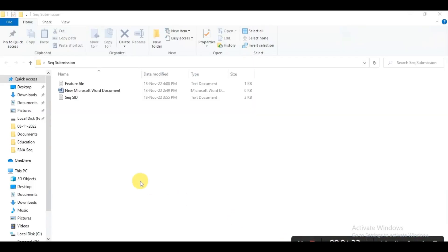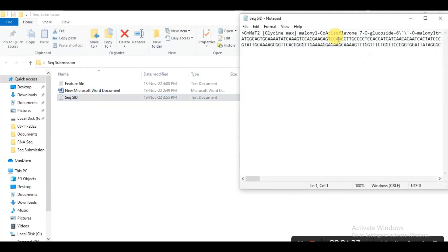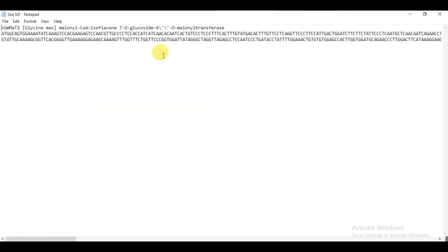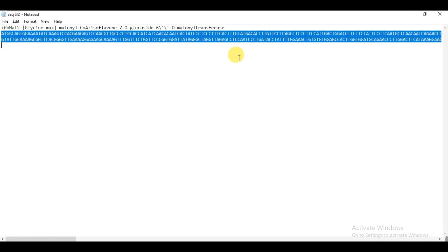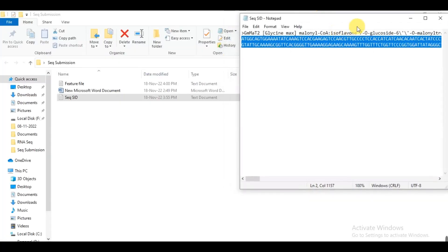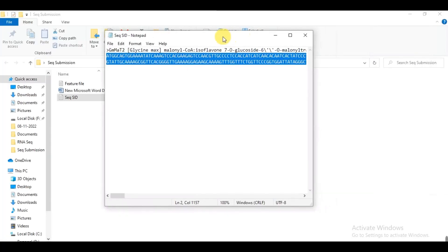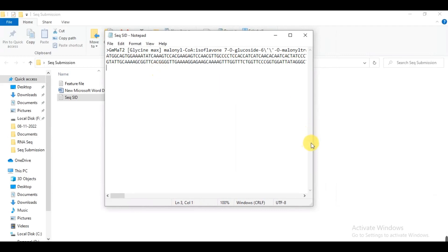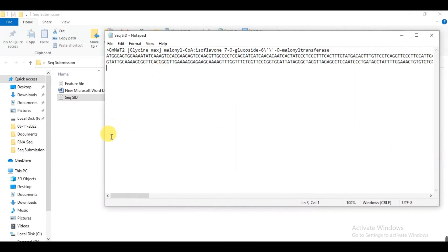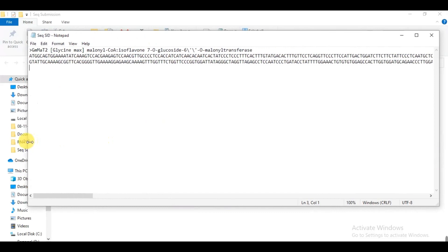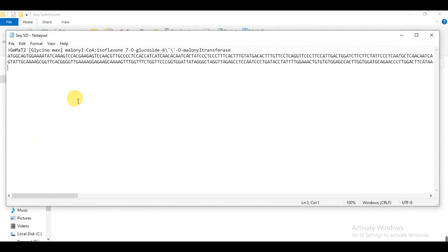First we need to prepare two files. One is our sequence file. This is my sequence file — this is the sequence of my gene that I have cloned and characterized its function through different experiments. You must arrange it when you do the sequencing: you use forward primer sequencing and reverse primer sequencing.